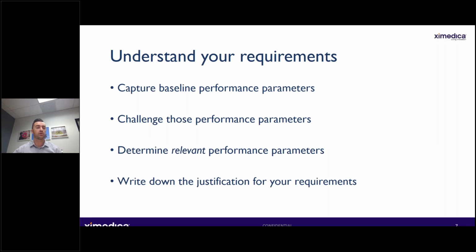Finally, the last thing I want to touch on is just understanding your requirements. So understanding the requirements for your assay is crucial to streamlining your development process. Moving requirements and moving targets and moving goalposts are some of the big causes of delays in any development process. So in this case, I'm really referring specifically to the requirements that your assay needs to run successfully.